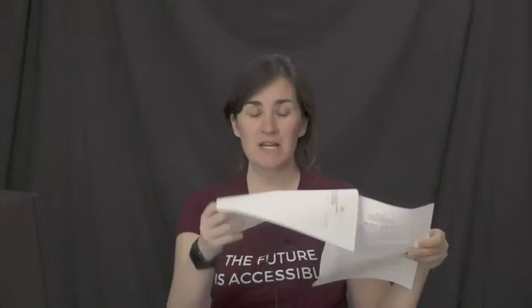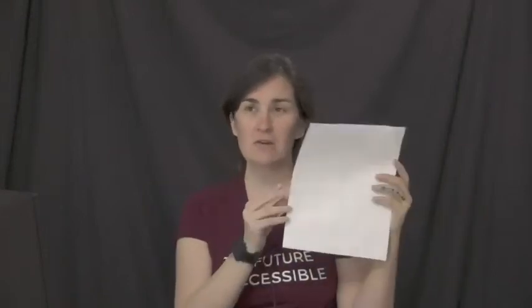There's a rubric. You'll turn this in with your written report. And then on the back is an interpretational chart. As you're going through, this helps you write down what test you did, when you did it, what media you used, and what it looked like. It can keep your stuff organized, okay?